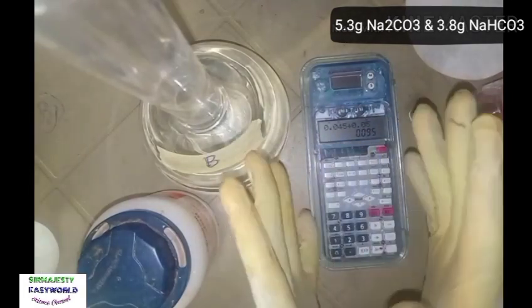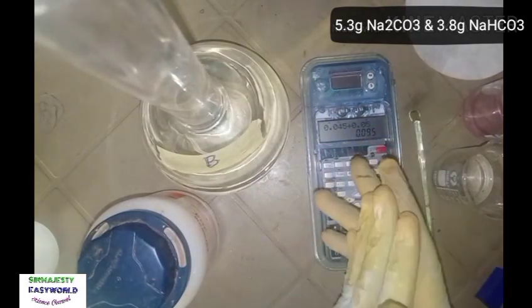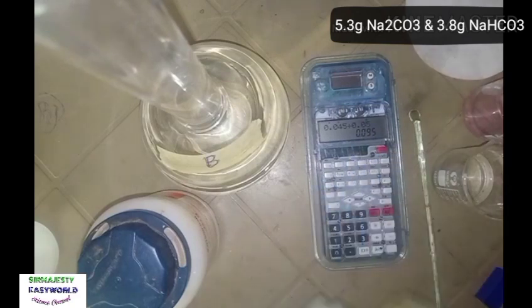That's the actual concentration, so that after your titration, you watch my titration to know the actual endpoint. But if you take it as 0.09, my dear, your endpoint will be close to 40 something, and that's risky because I know what you are using is actually a burette of 50. And when it is exceeding 50, students might find it boring.